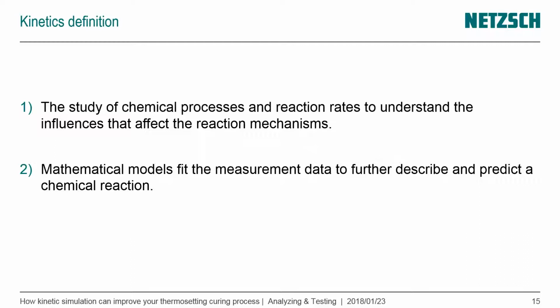And the second part of the kinetics definition is that we have to fit our measurement data with mathematical models. And then we will be able to describe and predict a chemical reaction for each temperature cycle the customer wants to use.